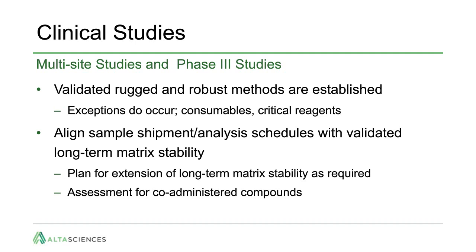In this case, minor method development and validation were needed for adjustments to chromatography. In another program, the critical reagent provided by a qualified supplier could no longer be produced with the same performance as previous lots. The method had to be completely reworked and a new validation conducted.